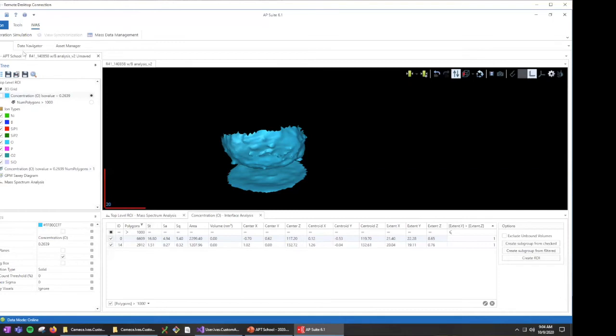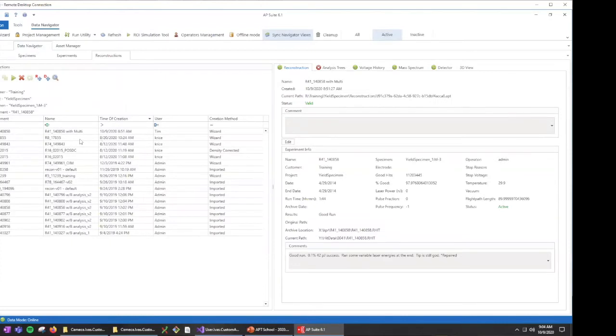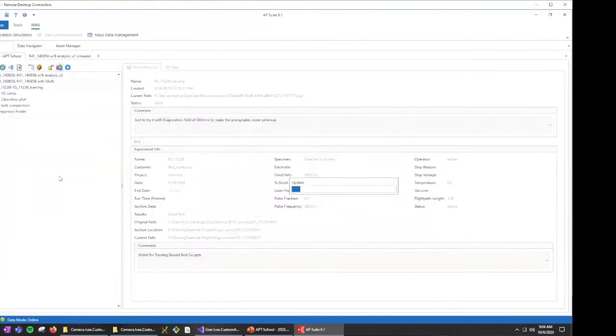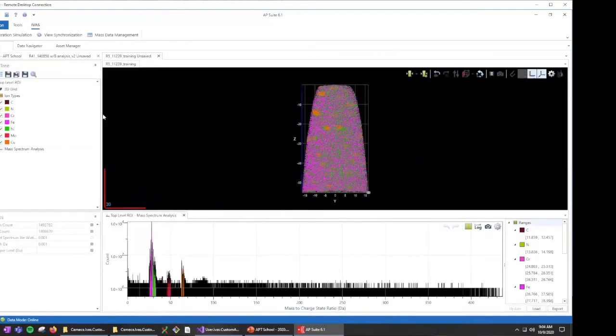This is especially handy for spatial ranging, which is actually the next thing that I wanted to show. So let's pull up basically everyone's favorite data set and see if I have the range file on this one. Yes, okay.